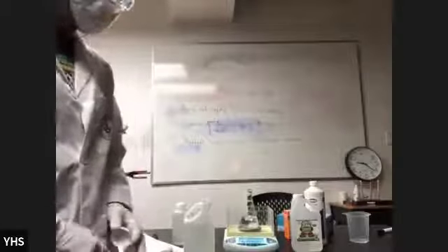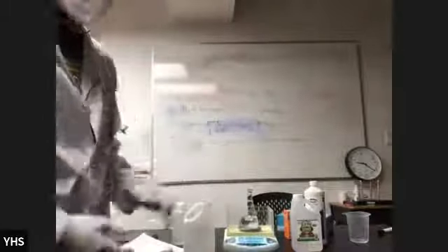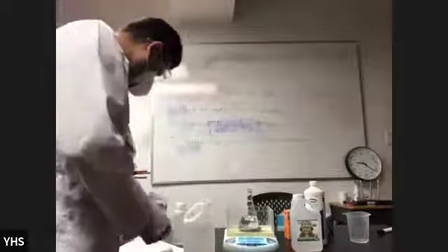Good? Okay, so what is the mass of the solvent itself? How much is the solvent only? You subtract the two values and you get 145. All right, cool. So the solvent only is 145 grams, right?